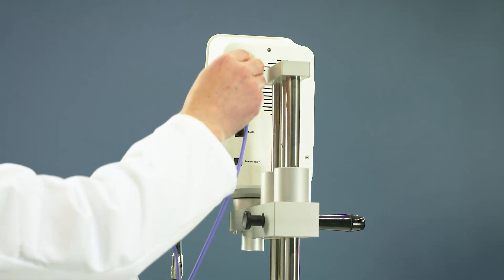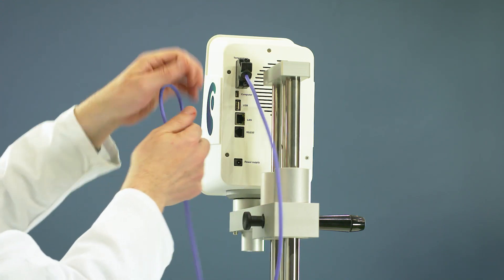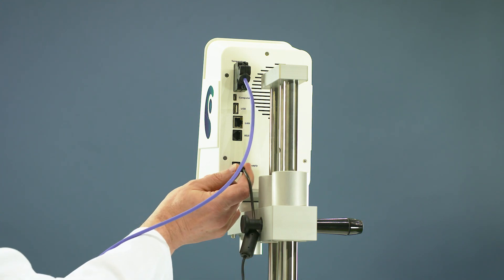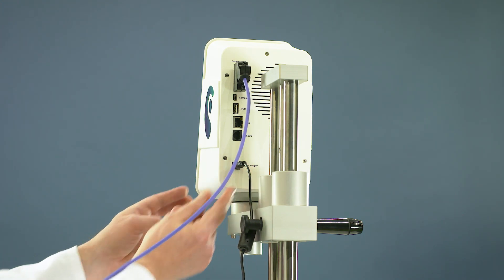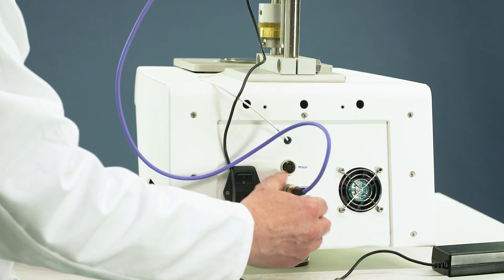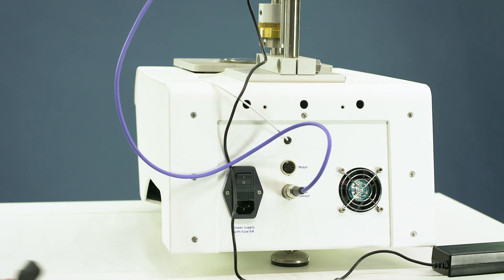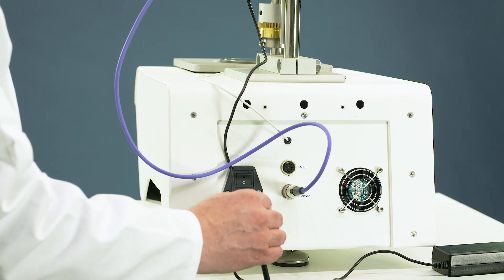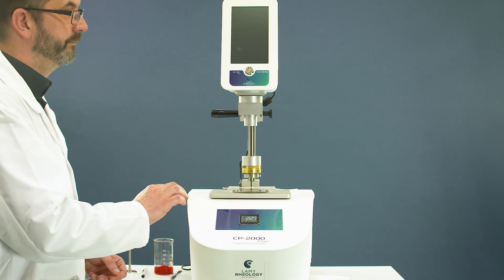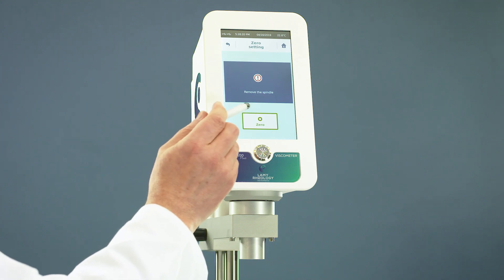Unpack your device and the connecting cable. Switch on the RM100 CP2000+. Zero the device — you should do this at least once per day.